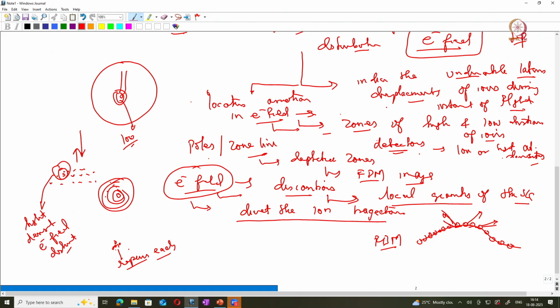The ion trajectories are diverted. So you will see on the detector low density regions just ahead of that particular high radius of curvature region. So you will have low atomic density here, and high atomic density there. Okay. So these are called trajectory aberrations, and these diversions of the ion trajectories, these artifacts, are directly related to the crystal structure.